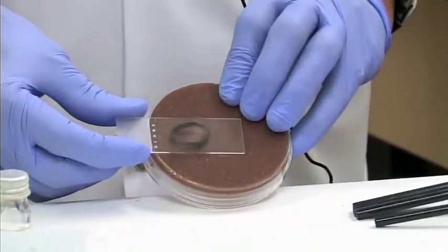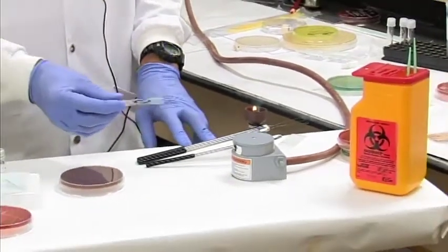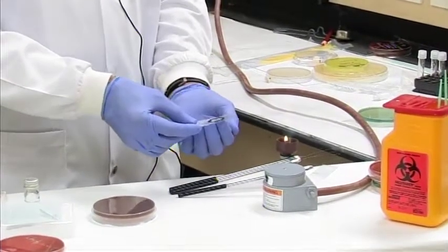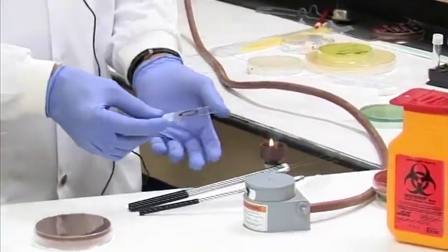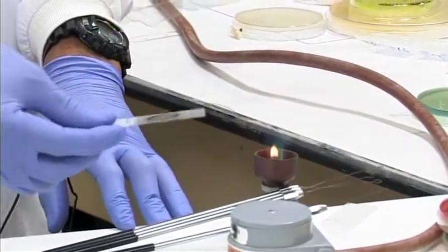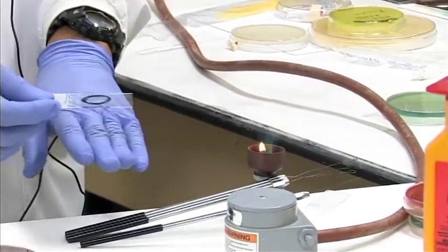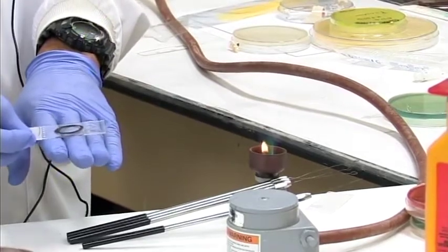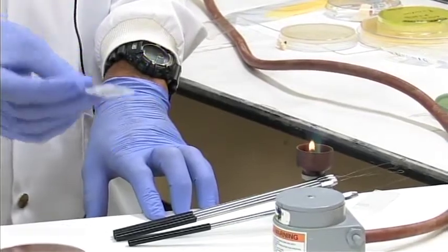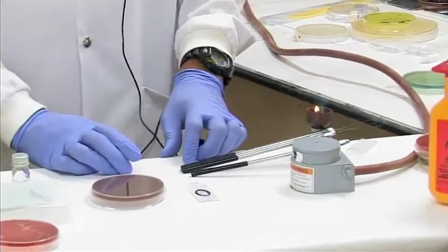Once it's dried, then you're going to move across to heat fixing. Now heat fixing is done. We're going to pass the slide, from the bottom of the flame, 3 times through the flame to allow the bacteria to adhere or stick onto the slide. So when you stain it, it doesn't wash off or come off. So you're going to go 1, 2, 3. 3 times through the flame. Touch it at the back of your fingers or hand. It should be just warm. You don't want too much heat, just gentle heat. And once that is done, the slide is now heat fixed, and we're ready to go across to the staining station now to stain for the gram stain.